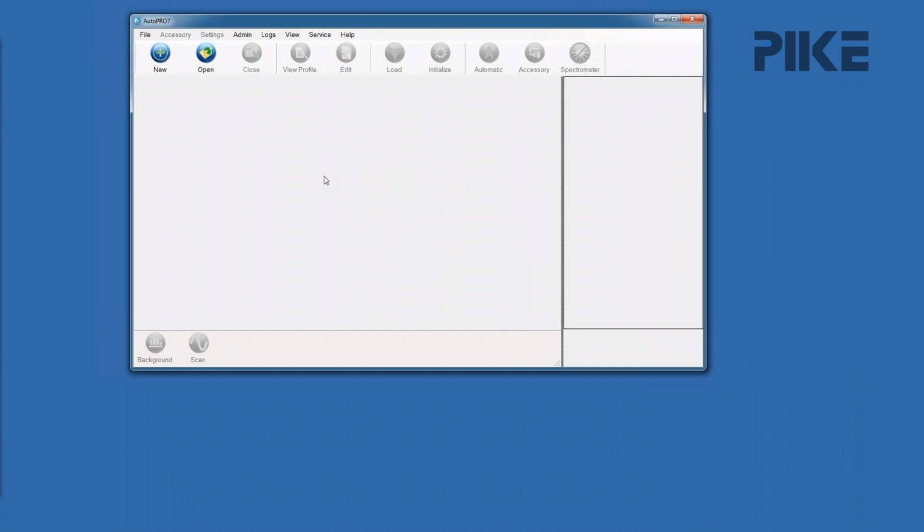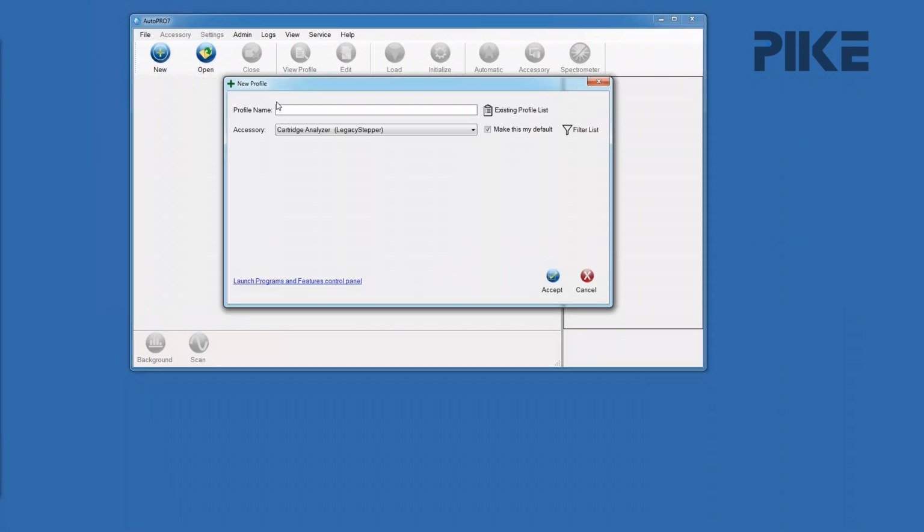Hello and welcome to a video tutorial on adding additional data points to a profile. Let's begin by selecting a new profile. We will call this cartridge 1.